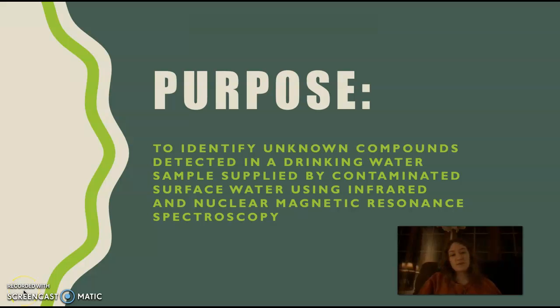What is the purpose of the experiment? The purpose of the experiment was to identify unknown compounds detected in a drinking sample supplied by contaminated surface water using infrared and nuclear magnetic resonance spectroscopy. Each water sample had different kinds of pollutants in it that contaminated the water.